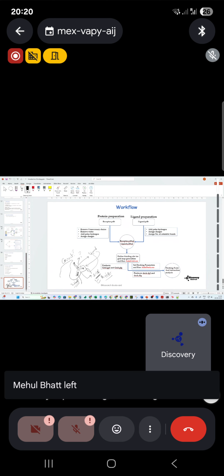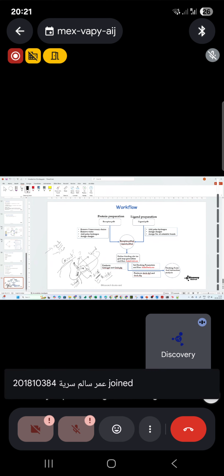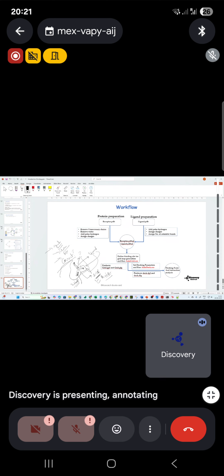That means your docking simulation is able to generate a conformation or pose similar to the original experimental pose. That means your docking protocol is working. Now you can use the same protocol, in the sense of how we set up the grid box, how we did the charges, and how we did the algorithm selection.